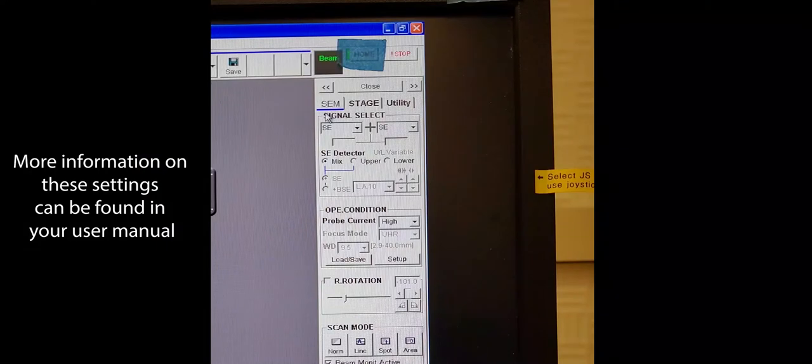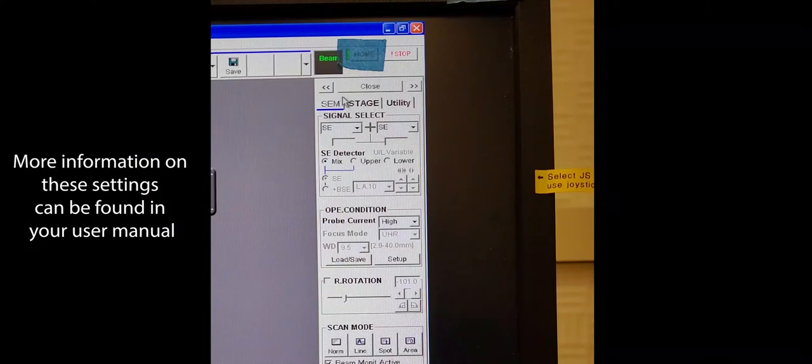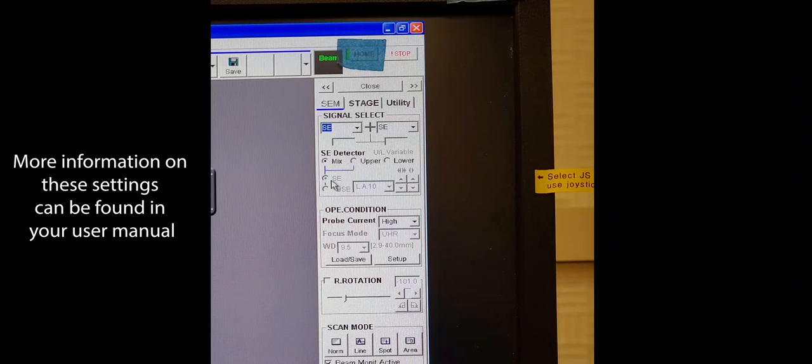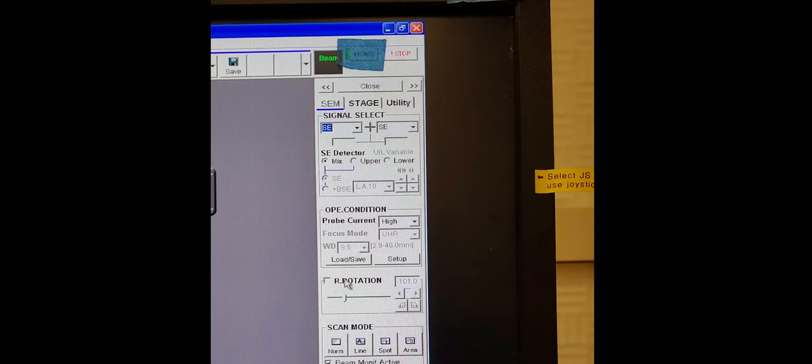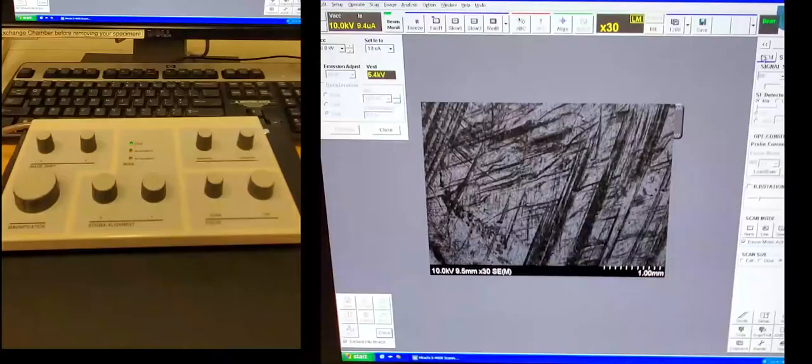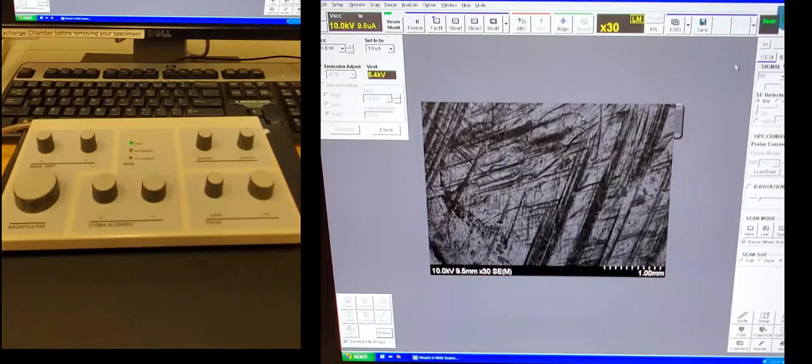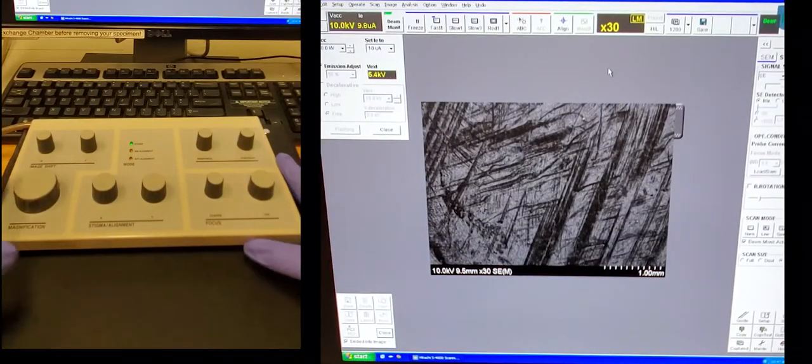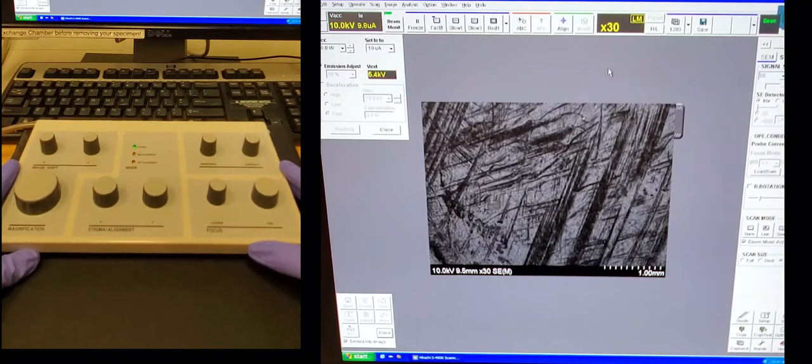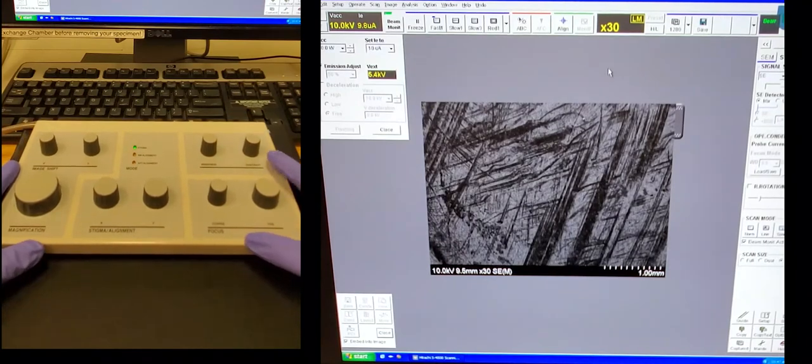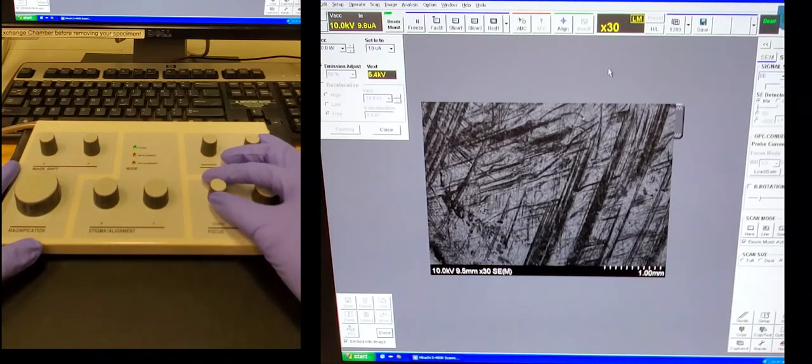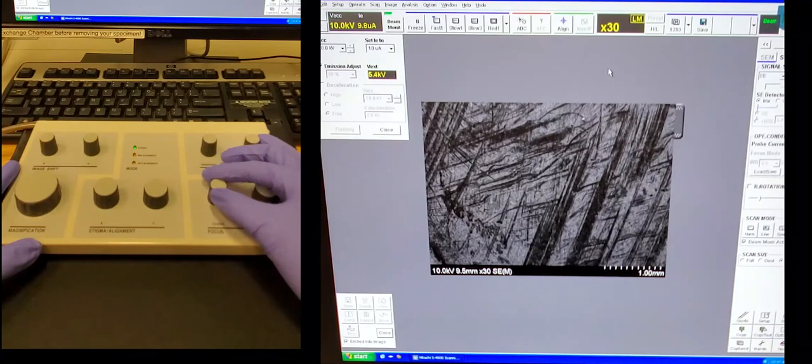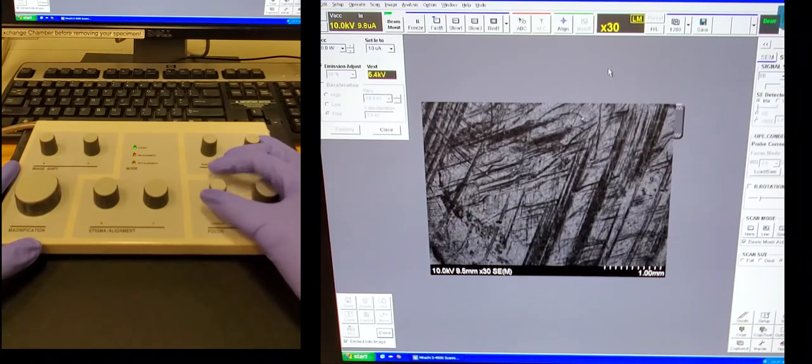Next we're going to come over to the SEM tab. Make sure that we're using the SE signal. You can choose which detector to use. The mix is generally good for most people. Make sure you set your probe current as desired, and we'll set the working distance to 8. If you need to rotate the image, you can check this raster rotation. So here you can see on the left the controls I'll be using, and on the right this will be the image.